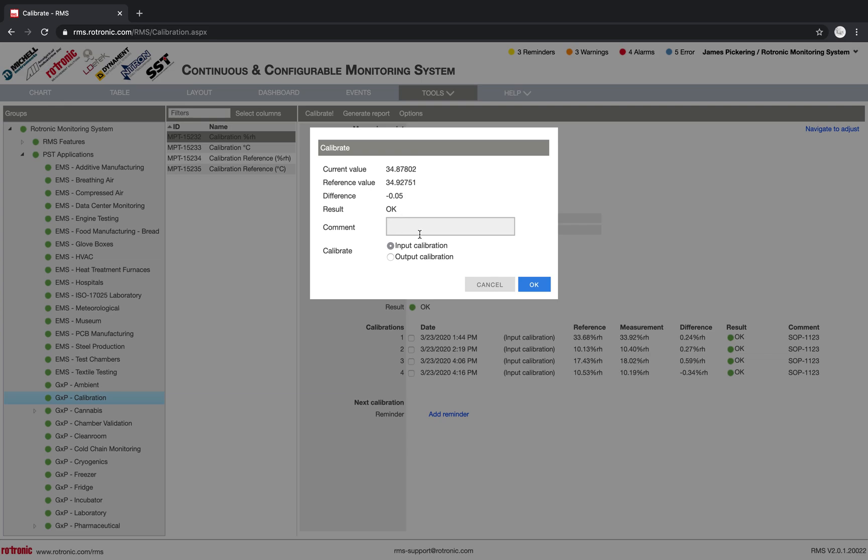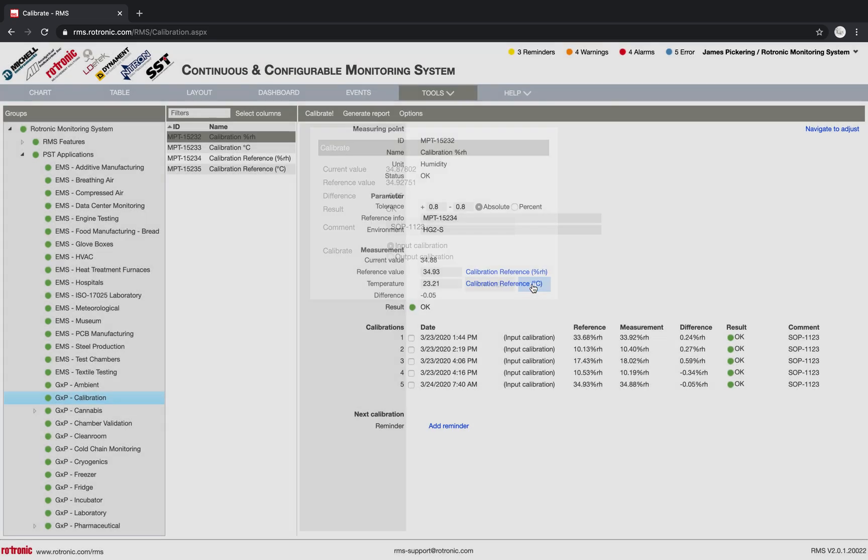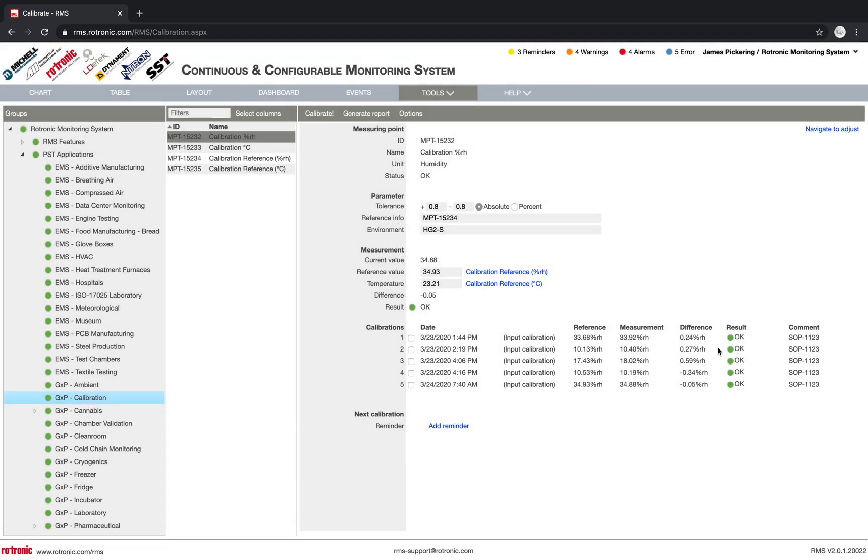So normally, when we carry out a calibration, we'll follow some kind of procedure. So here, for example, we're following the procedure SAP 1123. And then we define if it's an input or an output calibration. We click on okay, and the calibration appears here. So this calibration now has been carried out, depending on the requirements, perhaps we'll do one point, perhaps we'll do three points. For humidity, Rotronic recommends doing three points.